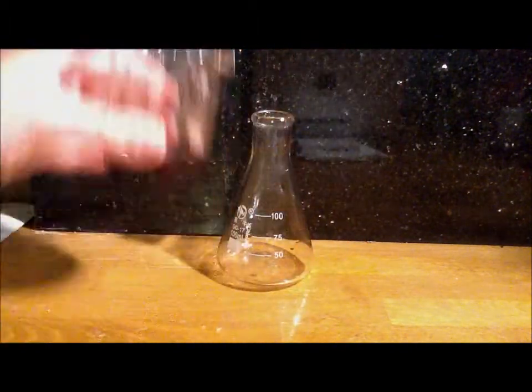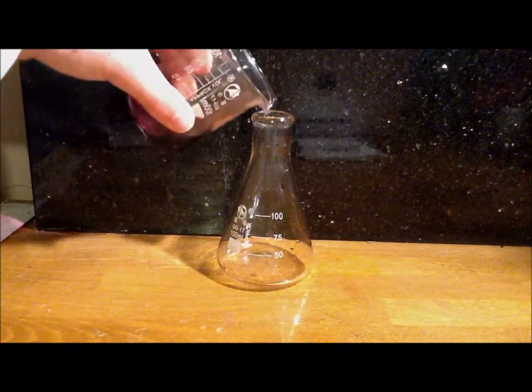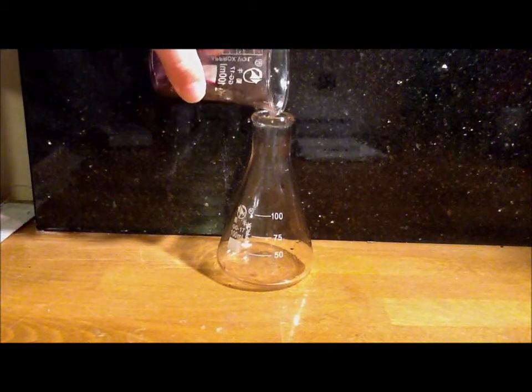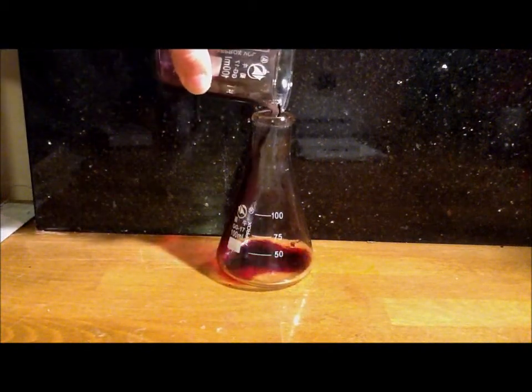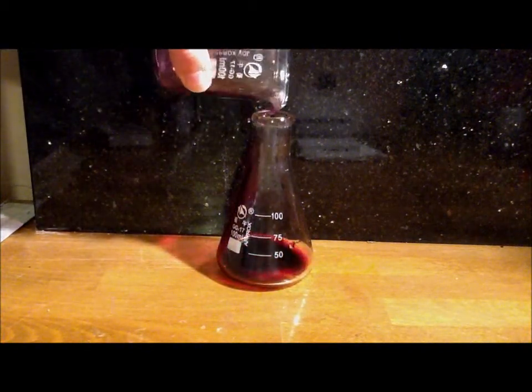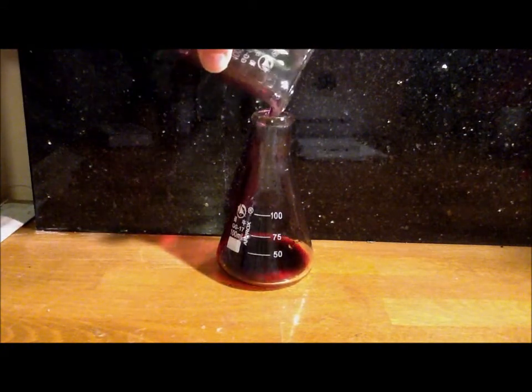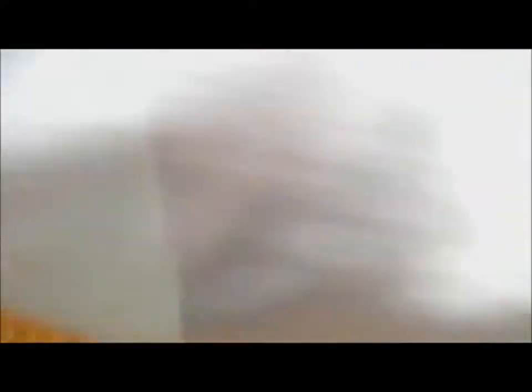So you just pour some of it in. You want about 5-10 milliliters. I'm going to put the rest of mine in.